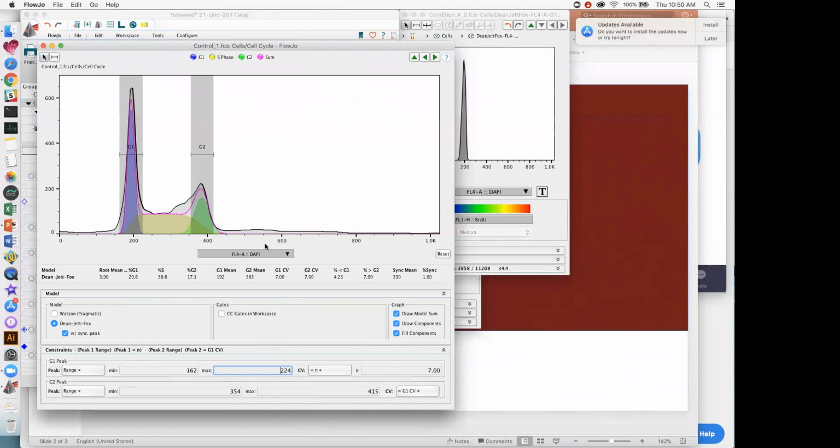Okay. To Ling Zheng, who asks, that means use the minimum RMS is better? Yes, go ahead and use the minimum RMS. That's a safe bet to go with.